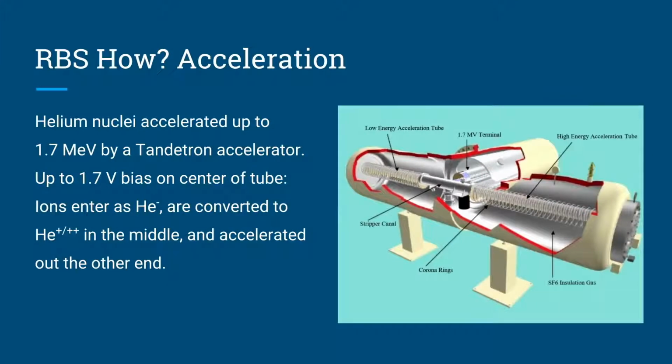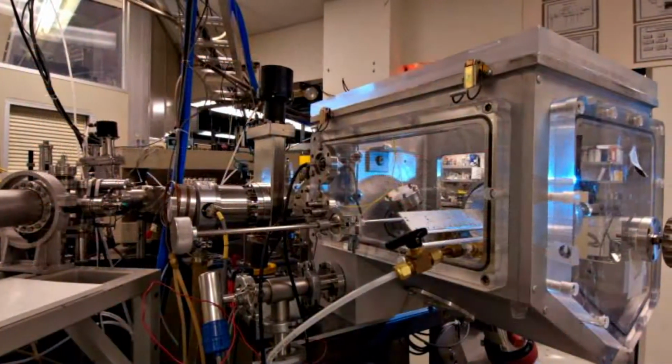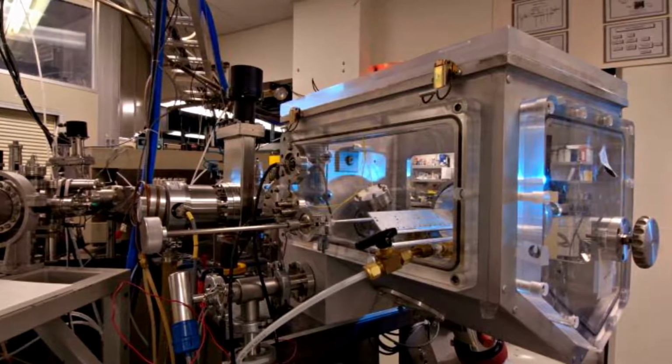Conditioning consists of field-dependent currents, the magnitude of which depends on the condition of the cathode surface. Tarnished, water vapor covered, or microscopically rough surfaces produce a much higher conditioning current than clean surfaces. High currents can cause breakdown, so care must be taken to ensure that all surfaces are clean and smooth.